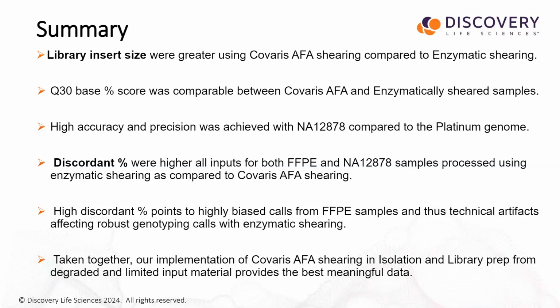That higher discordant percent of 5% to somewhere around 10% at times, and we all understand, is going to have a very dramatic effect on the accuracy of variant calling and things like that, especially from the clinical trial FFPE samples, where they're highly fragmented and highly degraded, and they have to be evaluated based on that.